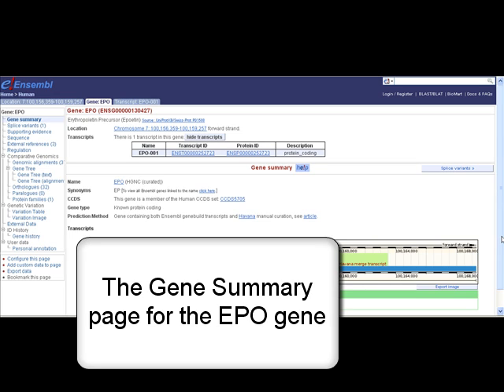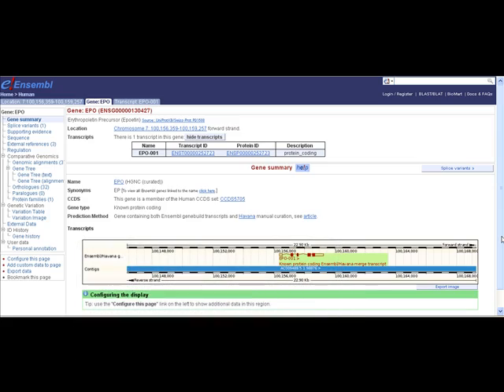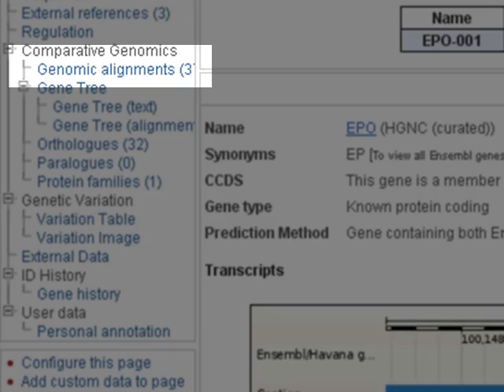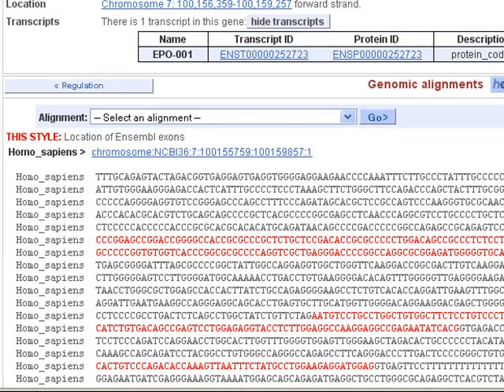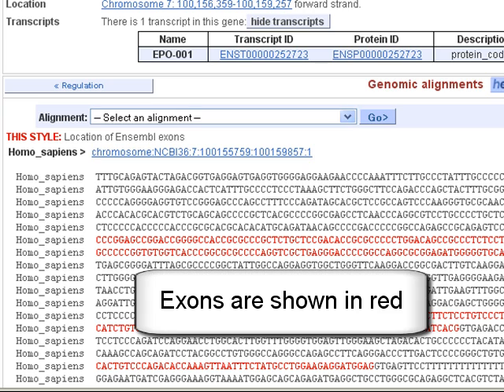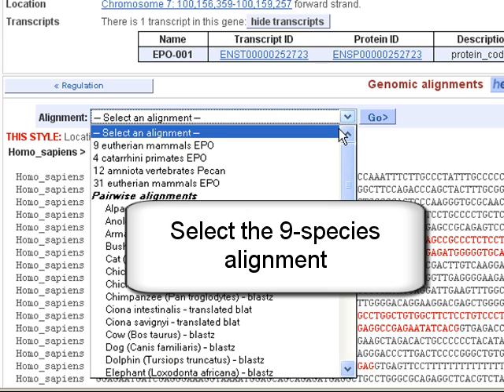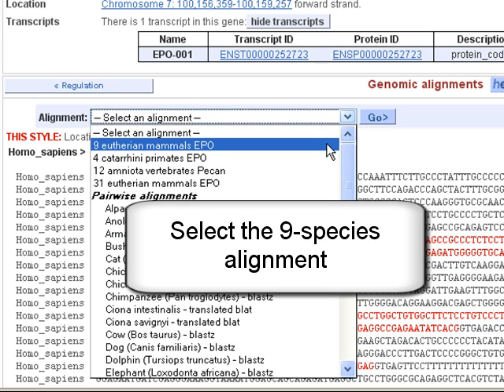Are there any conserved regions for the EPO gene in human when I look at a comparison across species? From the gene tab, click on genomic alignments. Only the human sequence is shown by default with exons highlighted in red, but I can select one of the multiway alignments — for example, nine eutherian mammals.